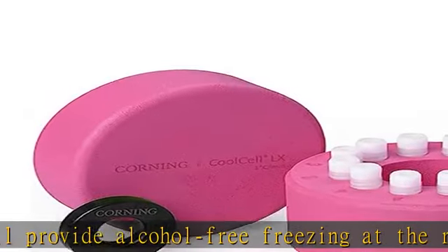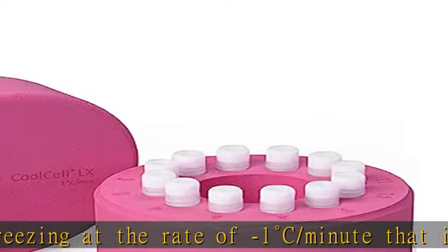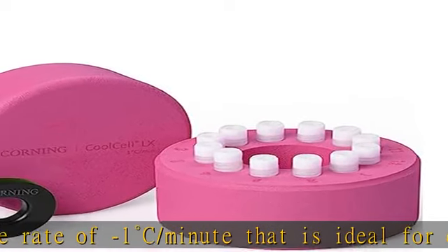Using a combination of uniform density cross-linked polyethylene foam, a solid state core, and radial vial symmetry, freezing profiles are consistent and reproducible.